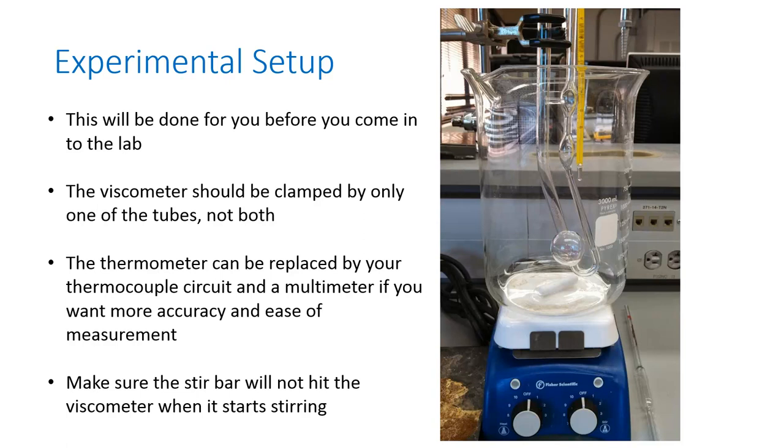The viscometer should be clamped into the water bath by the clamp you see there, which is attached to a ring stand. You should only clamp one of the tubes, the thicker one. You should not clamp across both tubes because then the viscometer won't sit straight up and down. It's very important that it sits straight up and down for proper function.